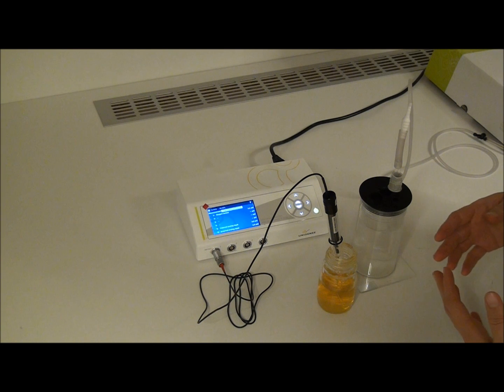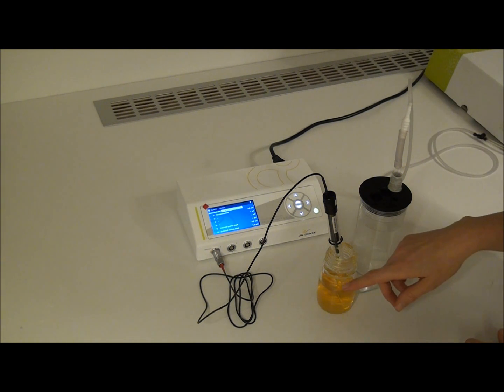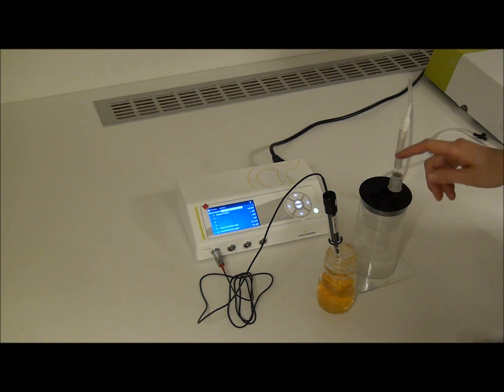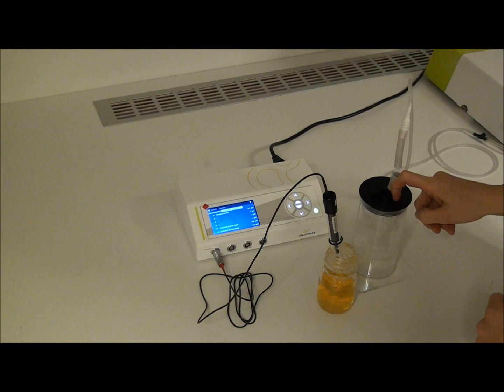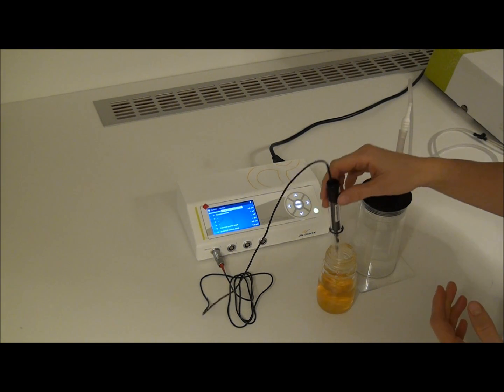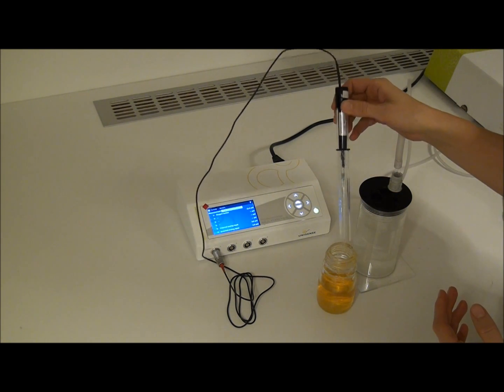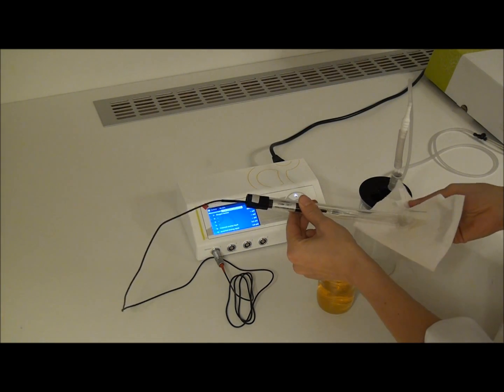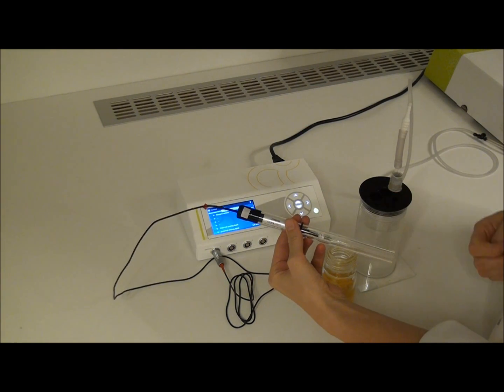The sensor meets the requirements when the signal in the ascorbic acid is below 10% of what you read in the saturated solution. When the sensor meets these requirements, you can take off the protection tube and the seal and perform your experiments.